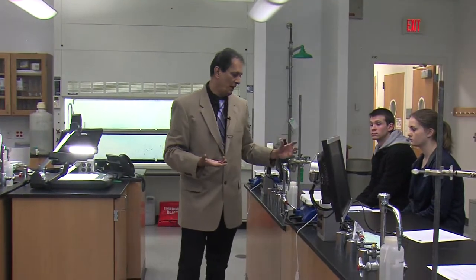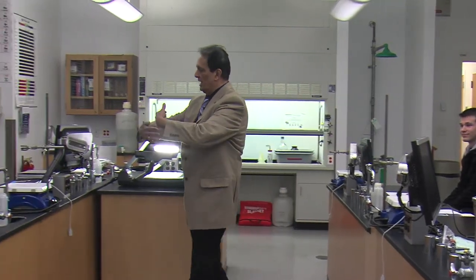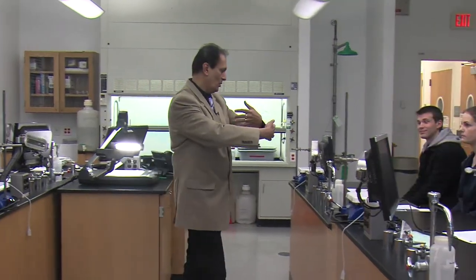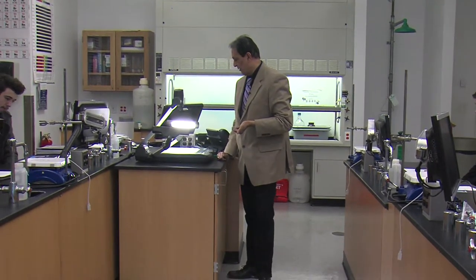So if you do not find a 50 milliliter beaker in your drawers, please go around and look for one, all right? And if you have extras, just give them. Don't say, this is mine, this is mine. That's like a 5 year old, all right? That's how they play. This is my toy, this is my toy. Don't do that, okay? So clean all that glassware at the end with regular tap water.